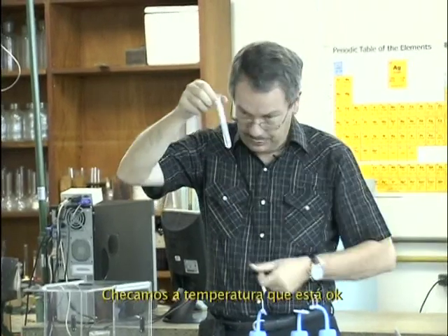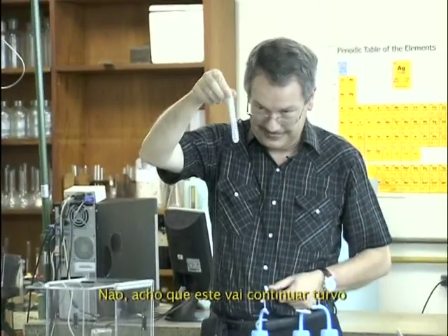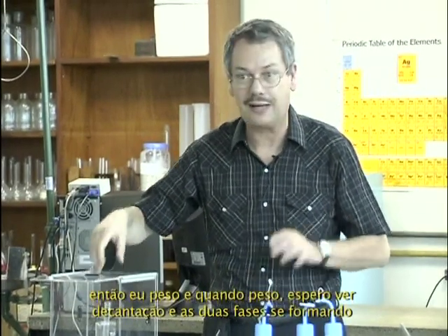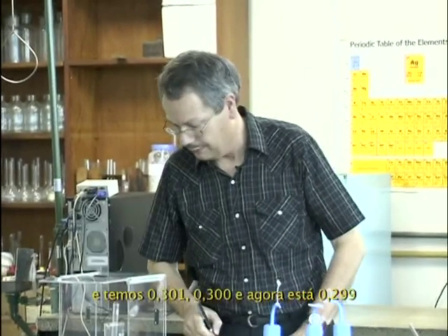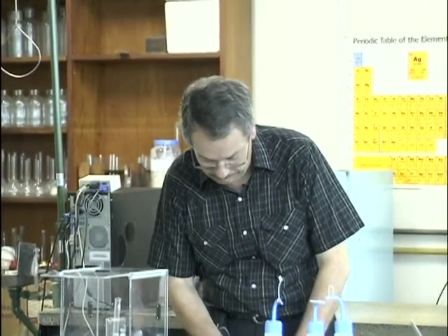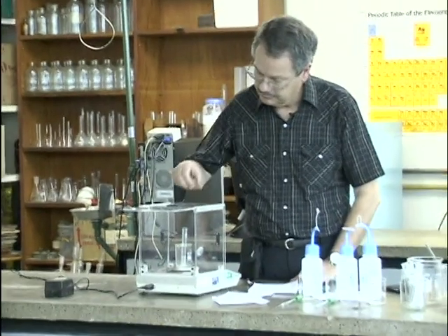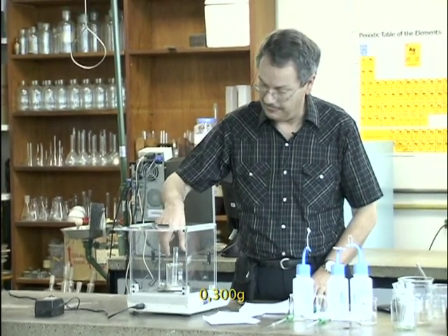But sometimes it takes a little while to equilibrate. I check temperature. Temperature is okay. I think this will stay cloudy. So I'll wait, and hopefully I will start to see decantation in 2 phases. So this is 0.301, 0.300, and now it's 0.299, 0.300 gram. But 0.300 gram.